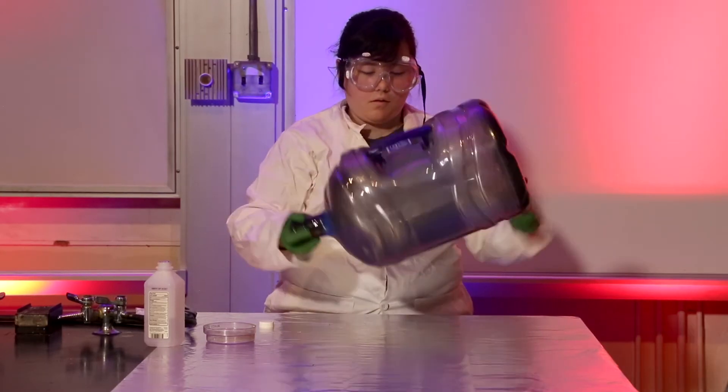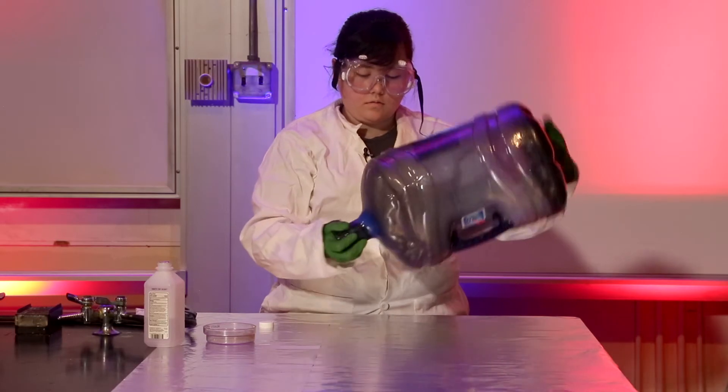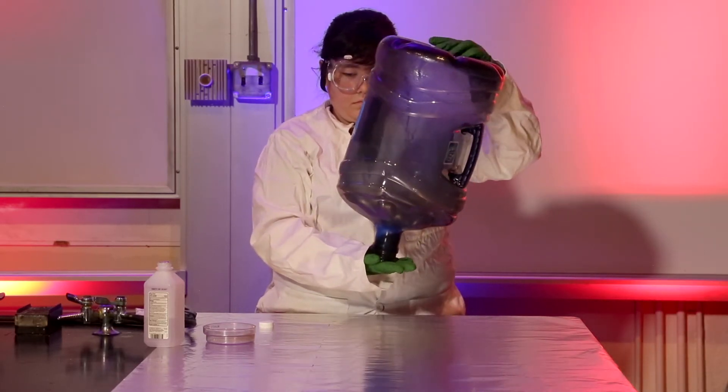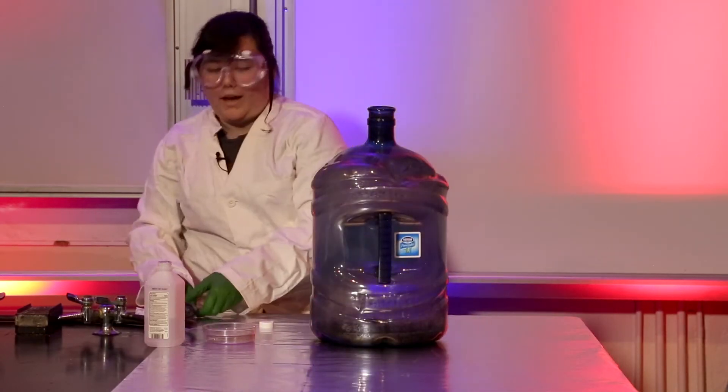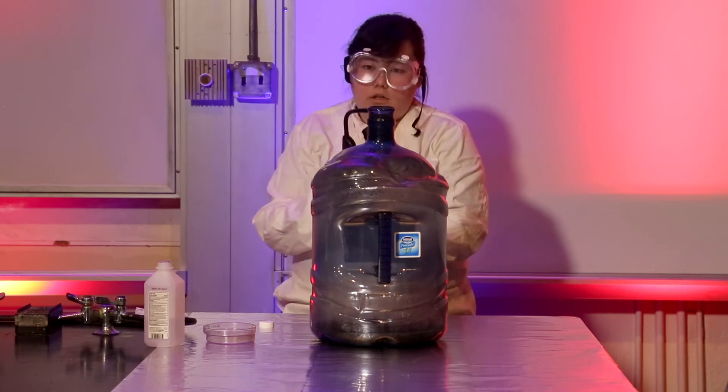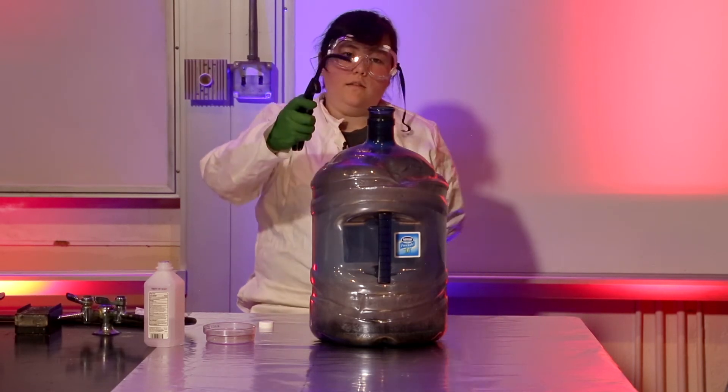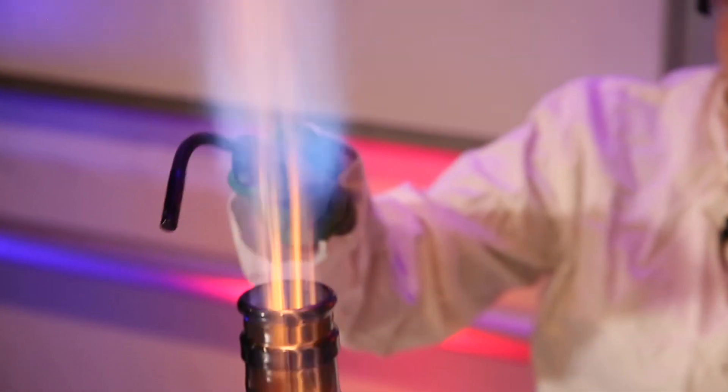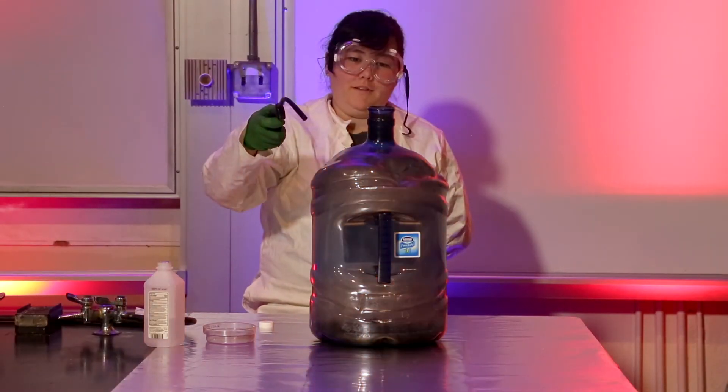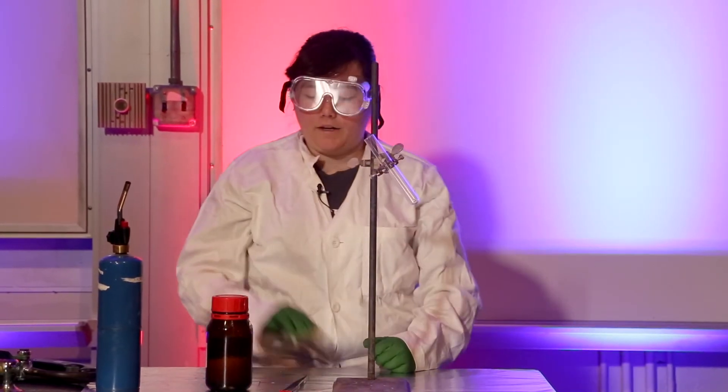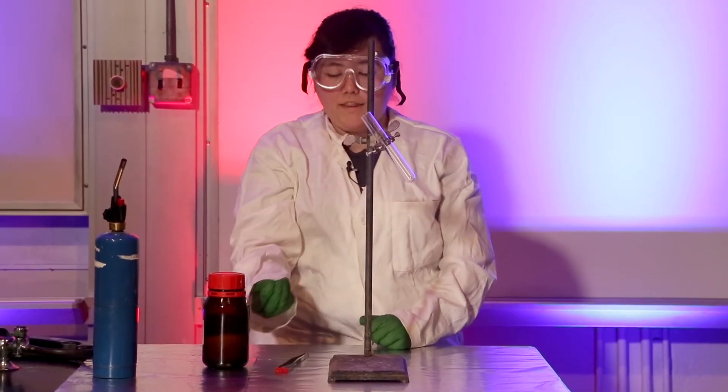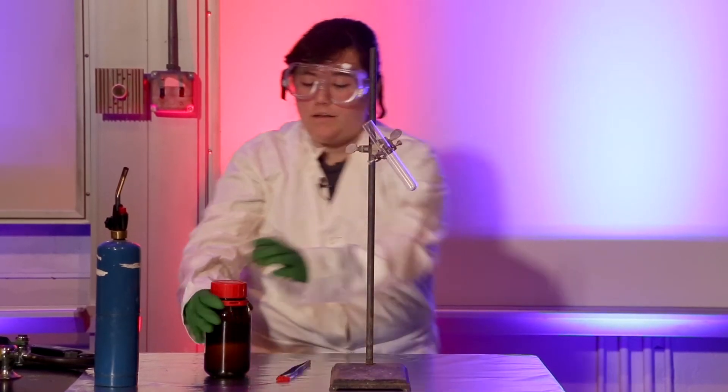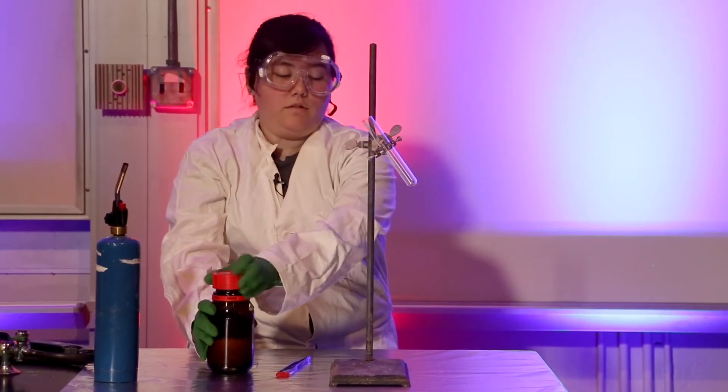Next up we have gummy bear torture chamber. Essentially what we're going to be doing here is heating up some potassium chlorate and dropping a gummy bear in it. The sugar within the gummy bear is going to react and make a really cool effect. First off, I'm going to add our potassium chlorate to our test tube here.